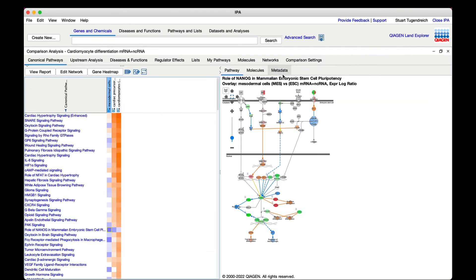For example, this pathway indicates how the cell's pluripotency program is inhibited as the cells differentiate away from the starting pluripotent stem cell state.